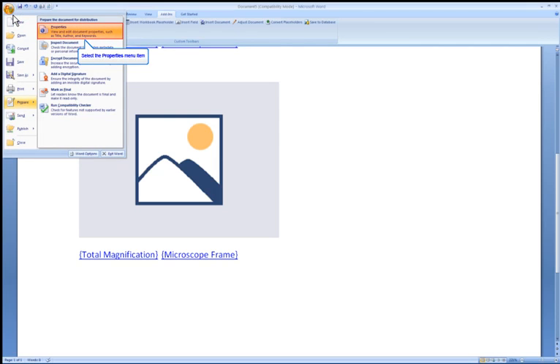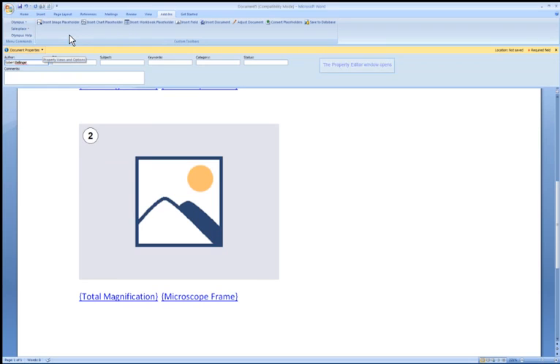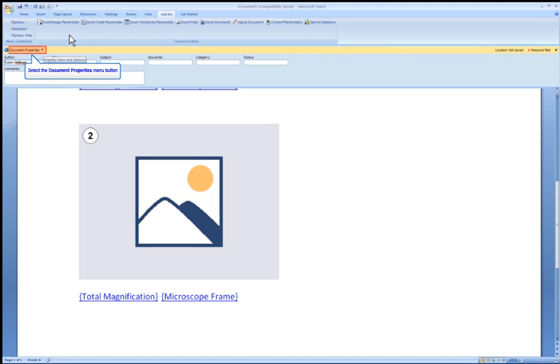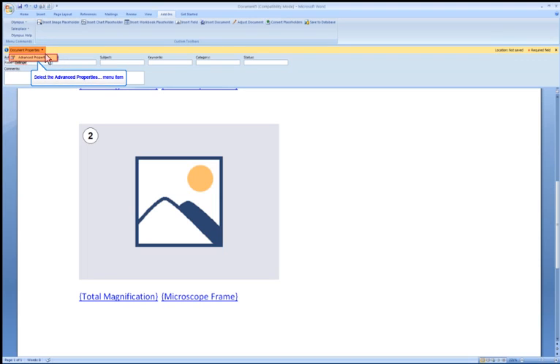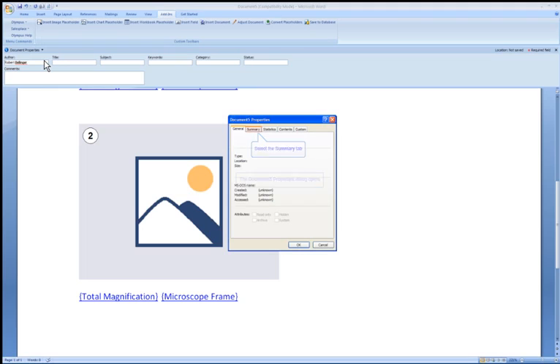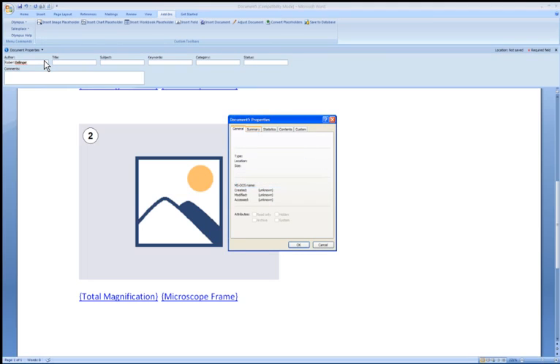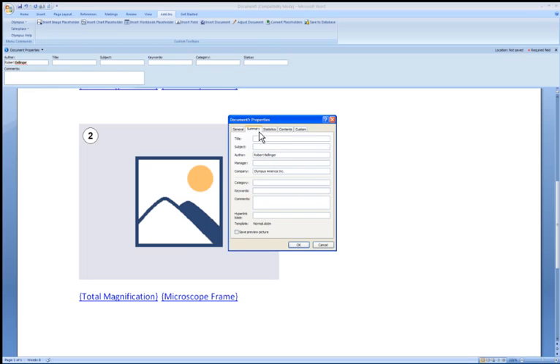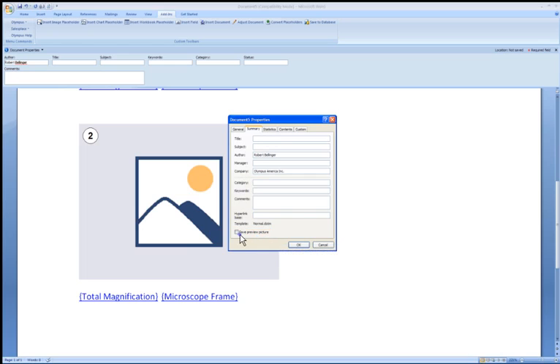Select Properties under the Prepare window. Select Document Properties to adjust Advanced Settings. Select Advanced Properties. Select the Summary tab. Place the check mark in the Save Preview Picture button. You can now click OK to close the window.